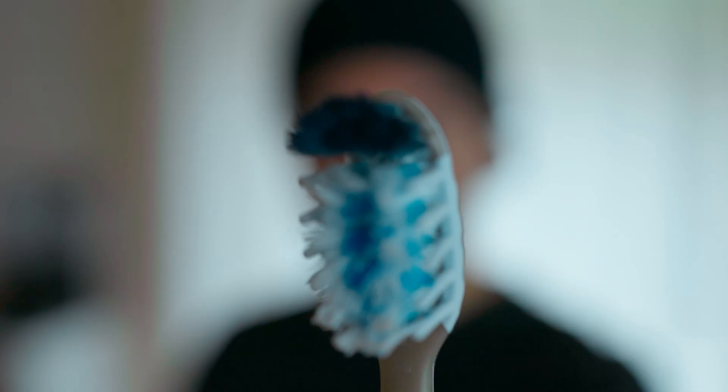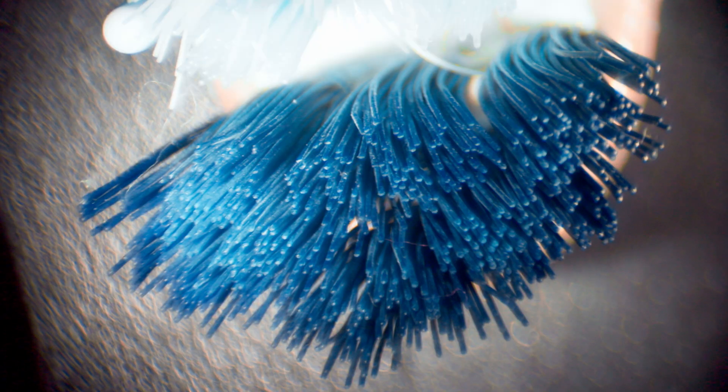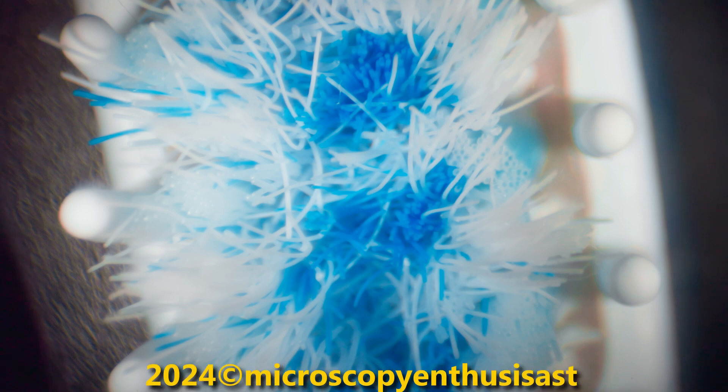Since you are still watching, here is a bonus footage. This is my used toothbrush and as you can see, the brushing plane is destroyed, so it won't perform well. You should change your toothbrush every three months. What else would you like to see under the microscope?